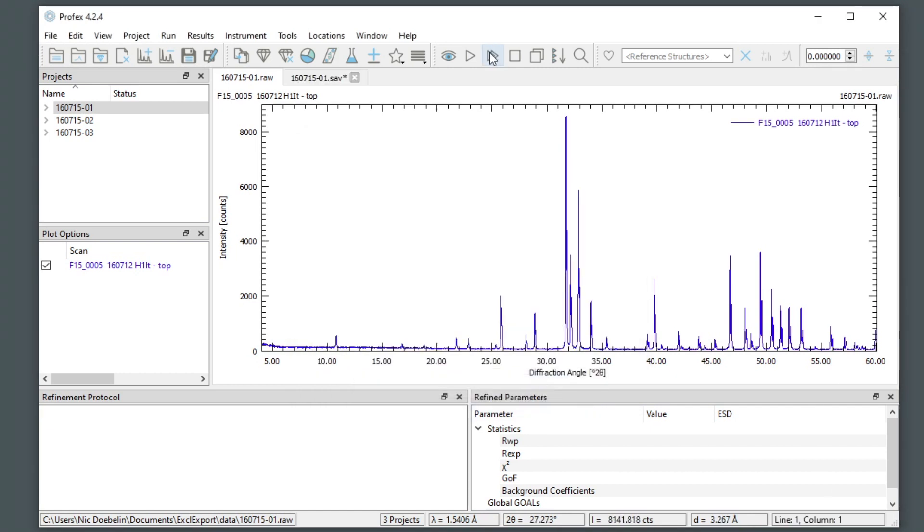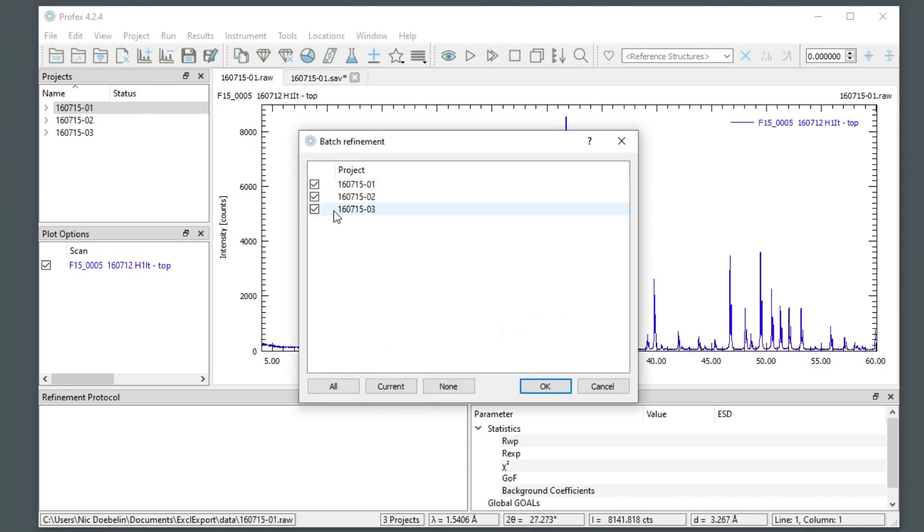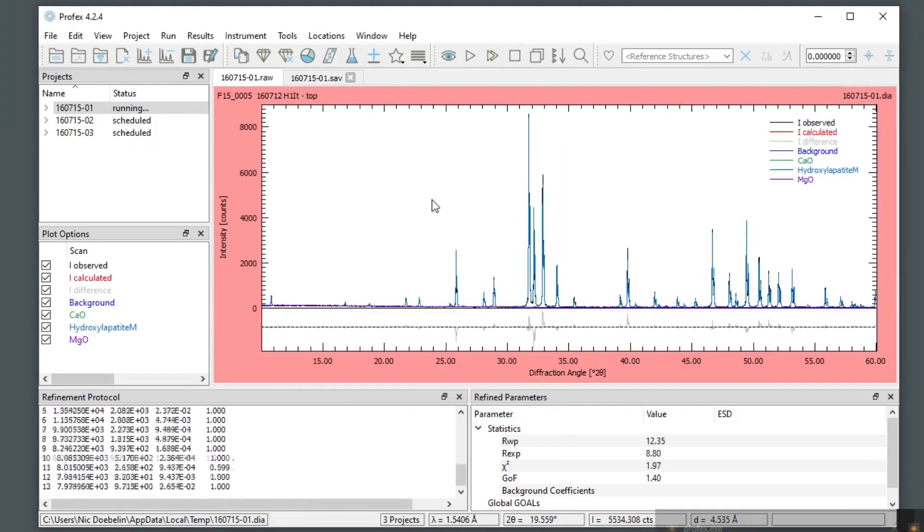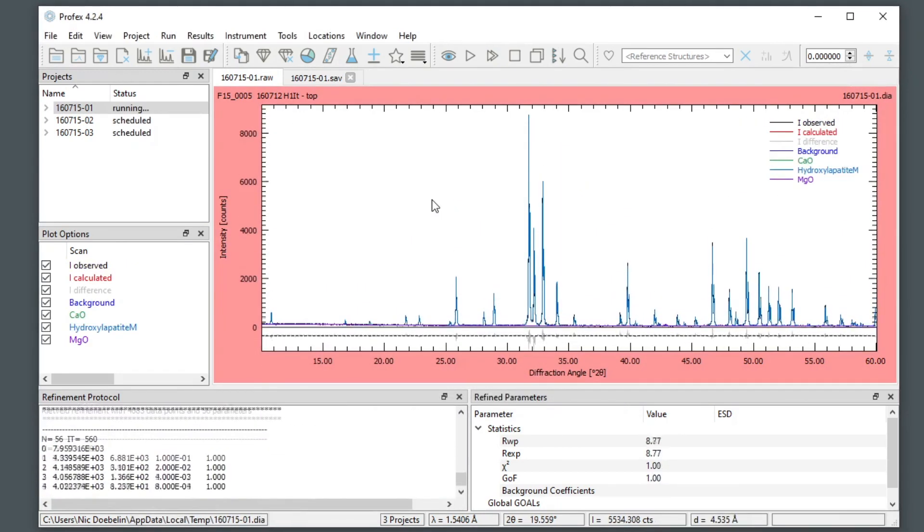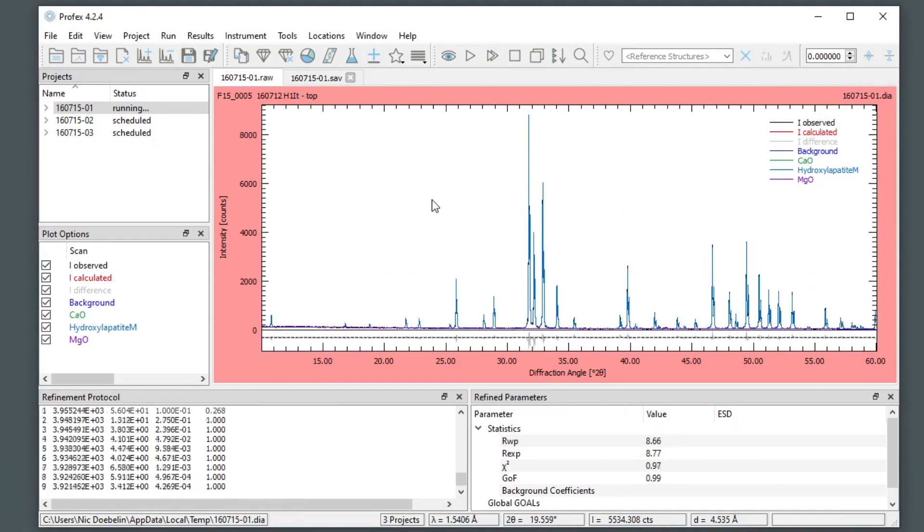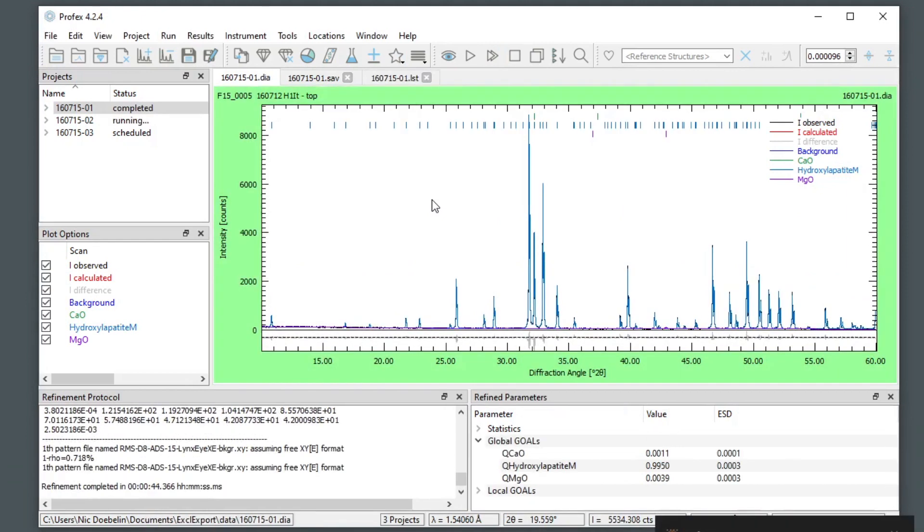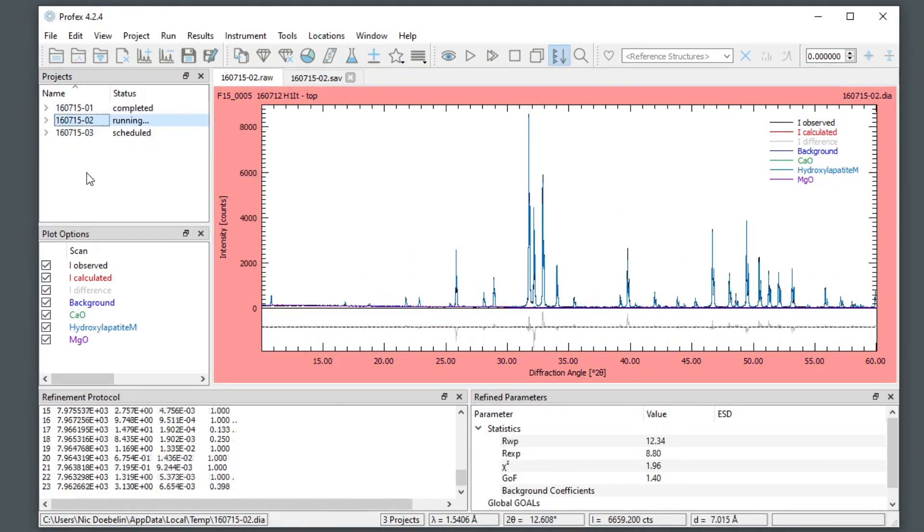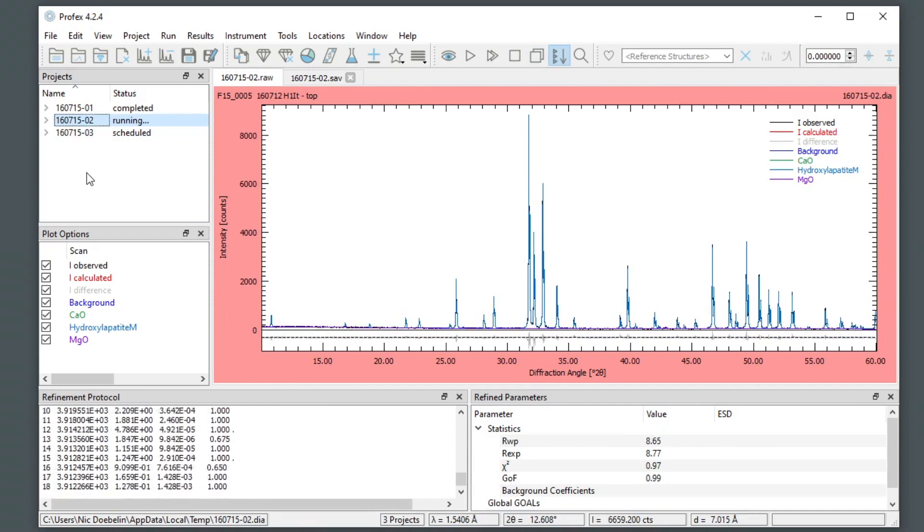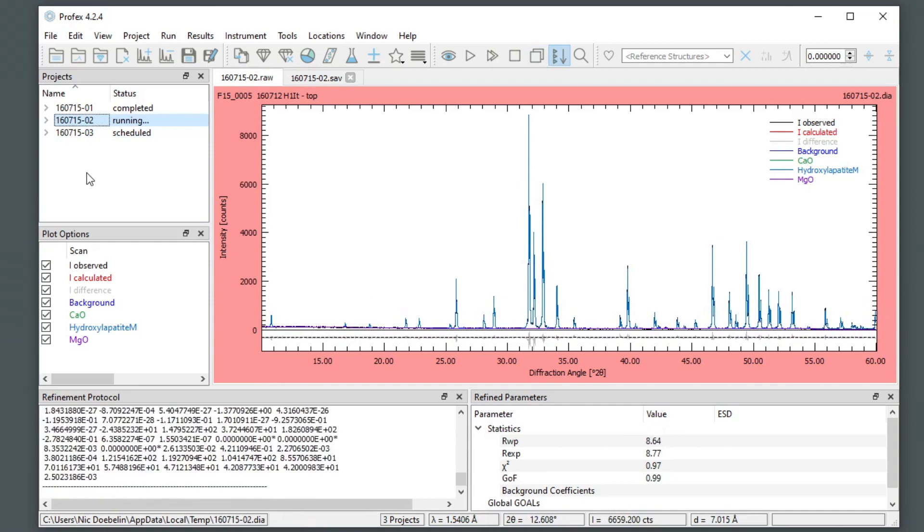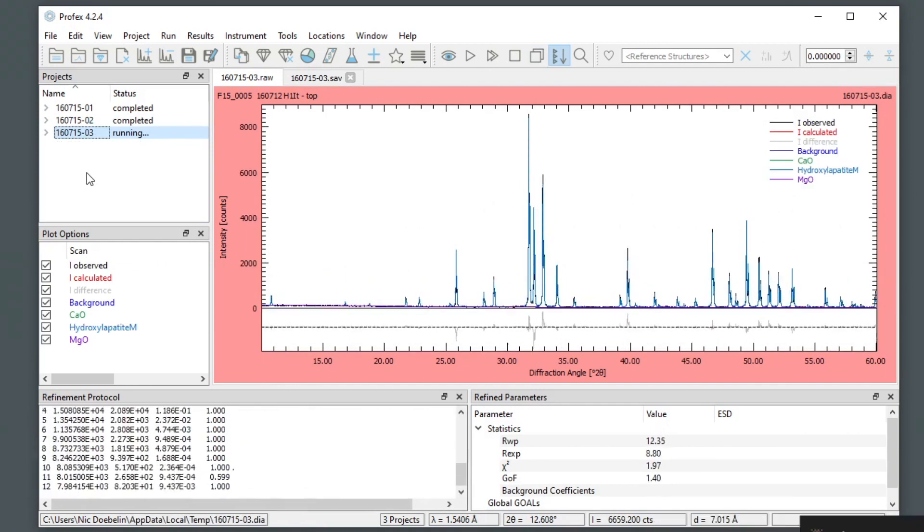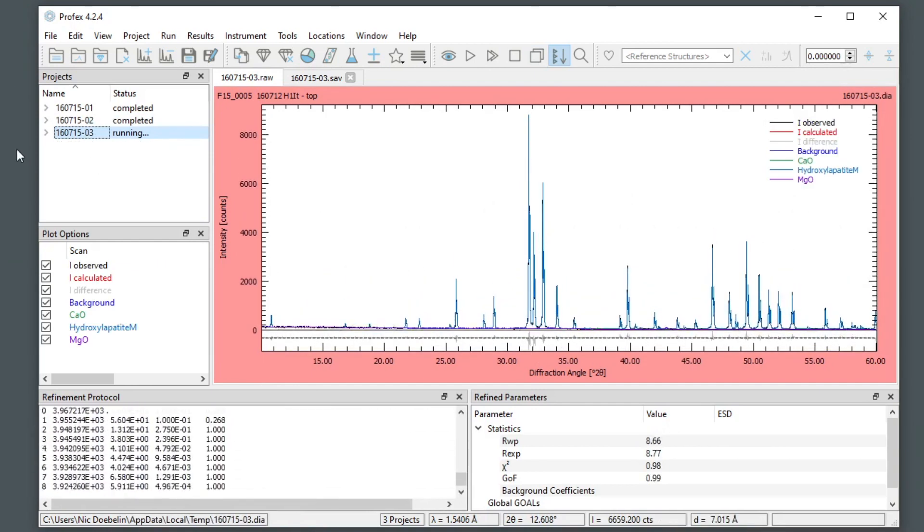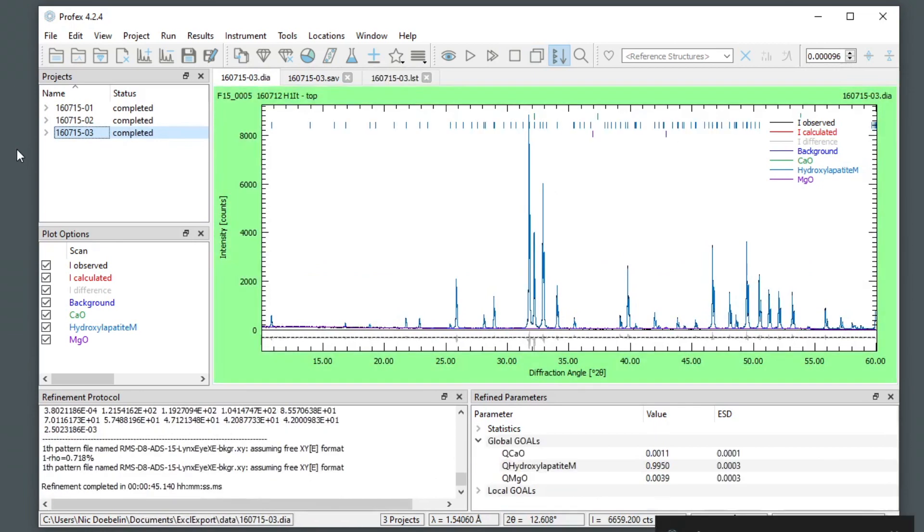And I can start a batch refinement to process all three files in a row.